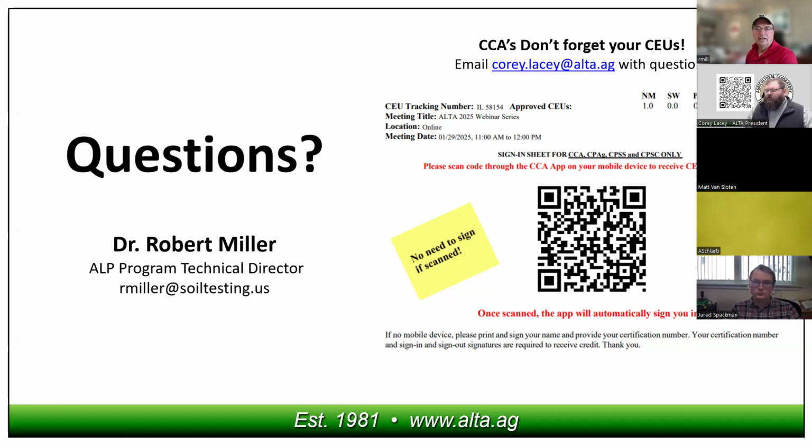Yes, I have a question about soil pH measured in calcium chloride. It is typically 0.6 to 0.8 pH units lower than pH measured in water, providing a more accurate measure of soil solution acidity and alkalinity by reflecting the concentration of hydrogen ions. This method is often preferred for soil analysis and used in Australia, with a range from 3.6 to 8 depending on soil texture. Is it better to measure pH in calcium chloride than pH in water?